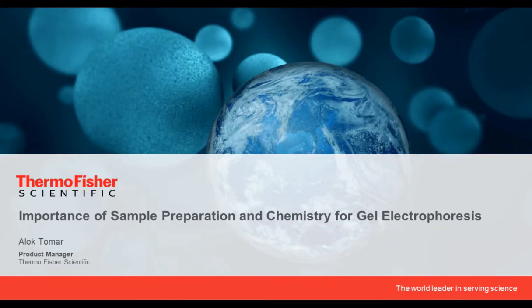Hello, everyone, and welcome to this gel webinar where we will review sample prep tips and go over key differences in precast gel chemistries that can affect migration, straightness, sharpness, and overall performance of your protein gel.